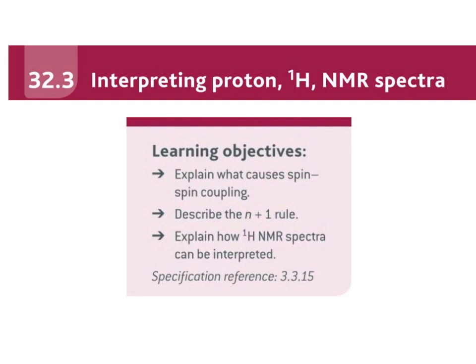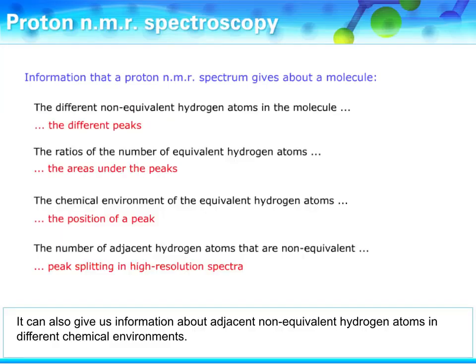This video is going to look at interpreting proton NMR spectra, and after this video you should be able to explain what causes spin-spin coupling, describe the n+1 rule, and explain in an exam how the spectra can be interpreted.